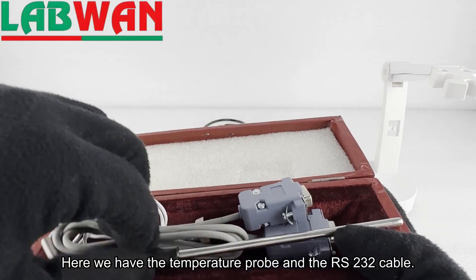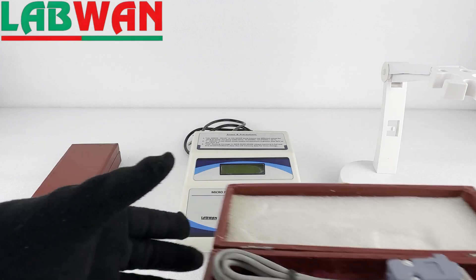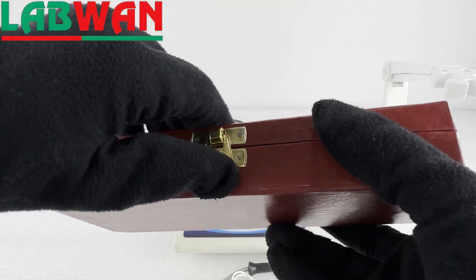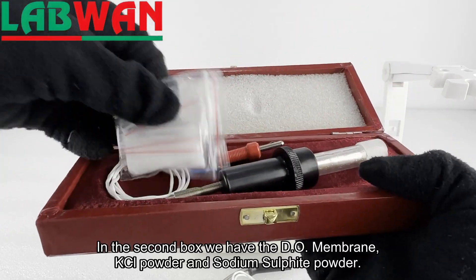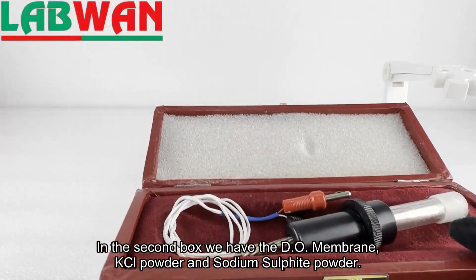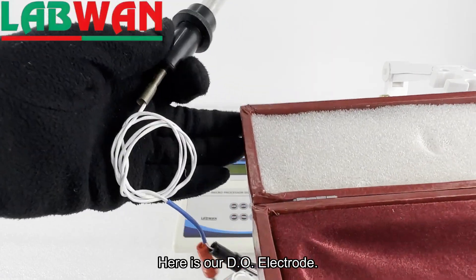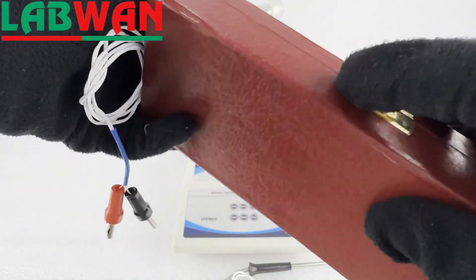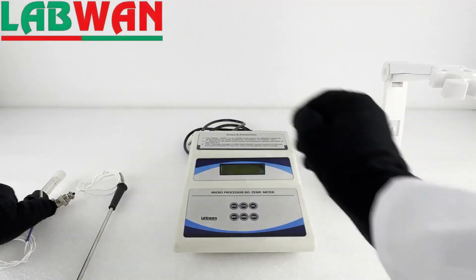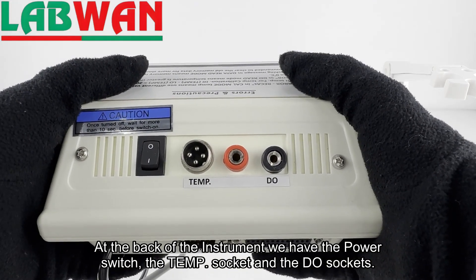Here we have the temperature probe and the RS-232 cable. In the second box we have the DO membrane, KCL powder and sodium sulfite powder. Here is our DO electrode. At the back of the instrument we have the power switch, the temp socket and the DO sockets.